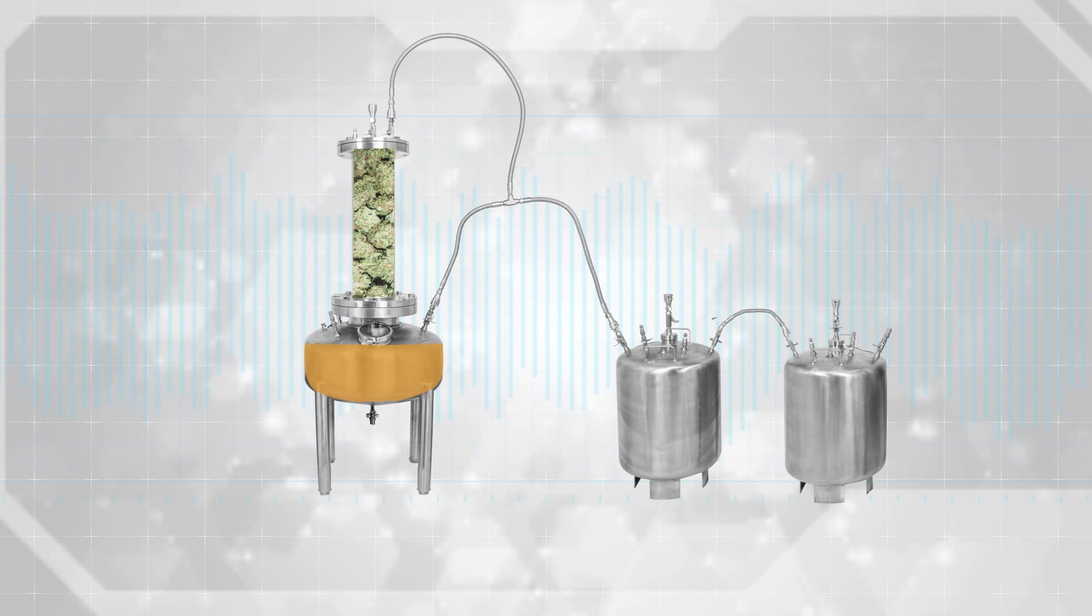By decreasing contact time and using mild cold temperatures you can increase yields and the array of compounds extracted while also decreasing overall production times. If in doubt be sure to watch the slideshow of all the products created with titanium extractors at the end of this video.